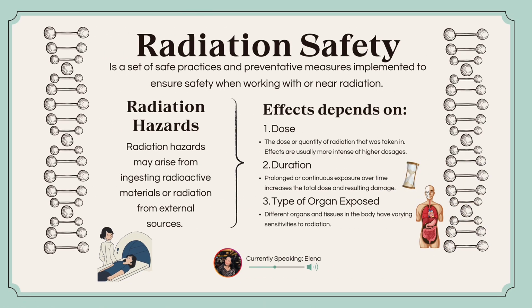What is radiation safety? Radiation safety is a set of safe practices and preventative measures implemented to ensure safety when working with or near radiation. Radiation hazards may arise from ingesting radioactive materials or radiation from external sources.